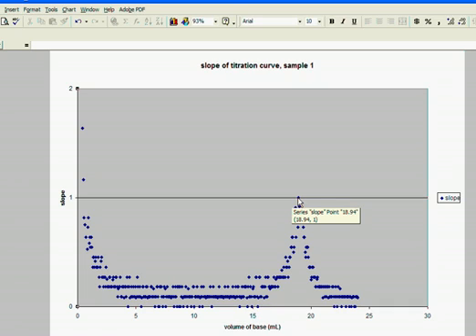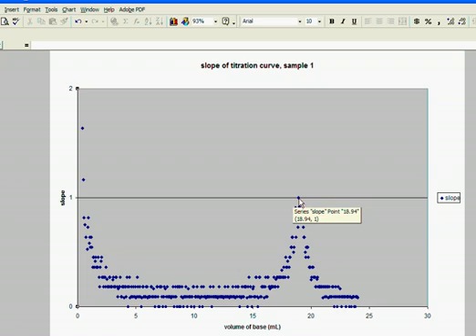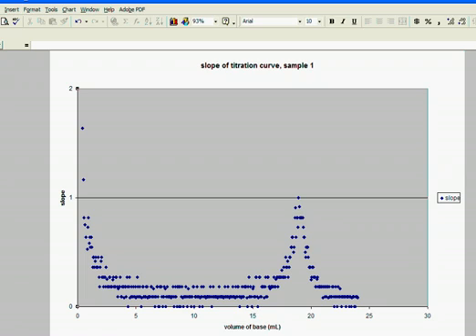And just by holding my cursor on that point, I can see that the x-value of that point is 18.94. The y-value is 1, so the slope is 1. And the x-value of the volume of base added at the end point is 18.94 milliliters. And that is the value I needed, the value of base added at the end point. So I can plot this one out too. And that is all you need to plot out the two graphs you'll need for your titration.